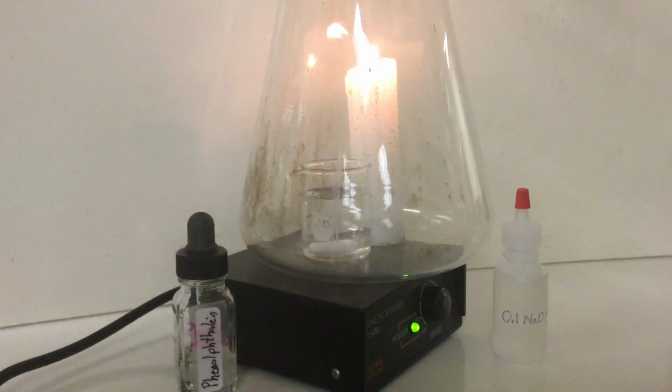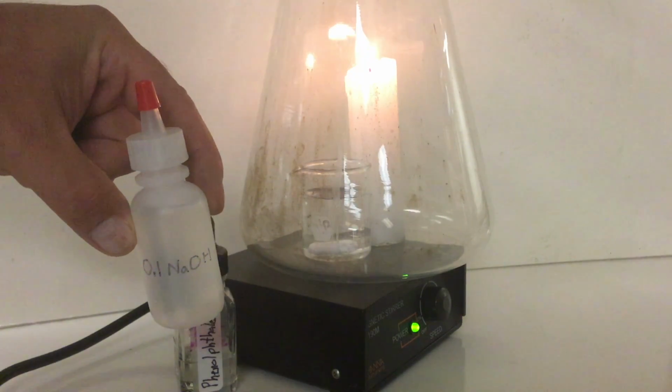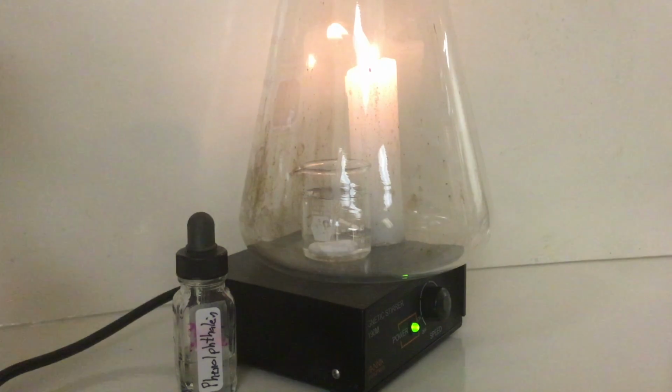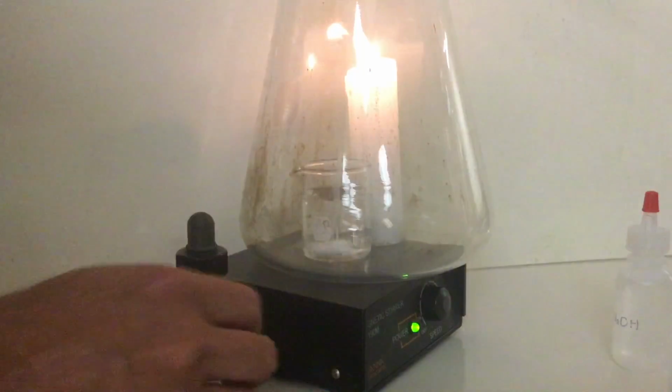All right, so right now I have water in this beaker, which represents something on Earth. Now what I'm going to do is I'm going to put a chemical inside that beaker. I'm just going to put a drop inside. It's called sodium hydroxide, NaOH. So I'm going to add that right now. All right, that's been added, and I'm going to turn on my stir so we can mix it all in there.